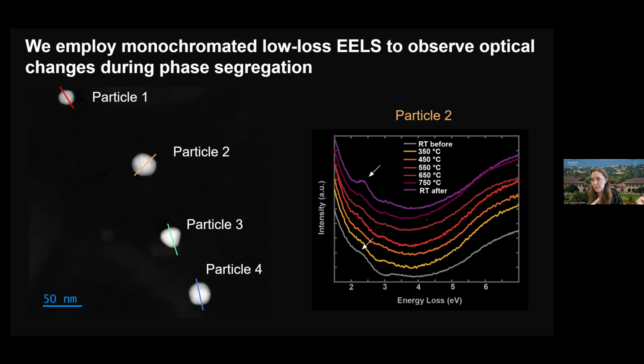We noticed some pretty cool things. First, as we heat the particles, we see a broadening and a redshifting of the plasmon, which is expected. But what was unexpected was that post-heating, if we compare the purple, which is room temperature after heating, so they're phase segregated, with the gray when they're a solid solution, we actually see a narrowing of our plasmon peak and even a slight blue shift, showing that we almost have a stronger optical response post segregation.